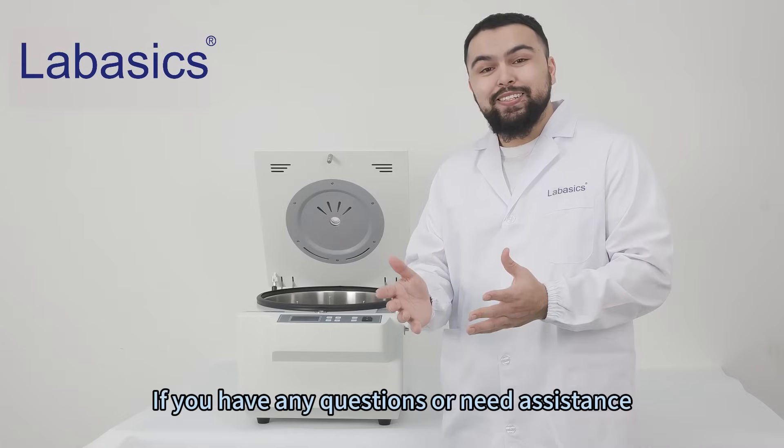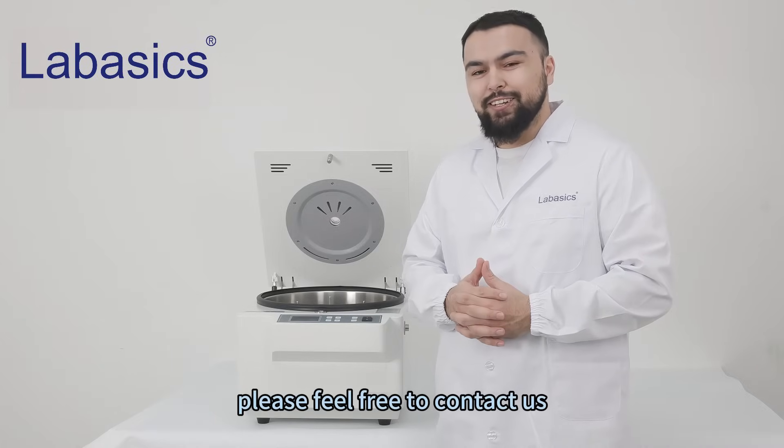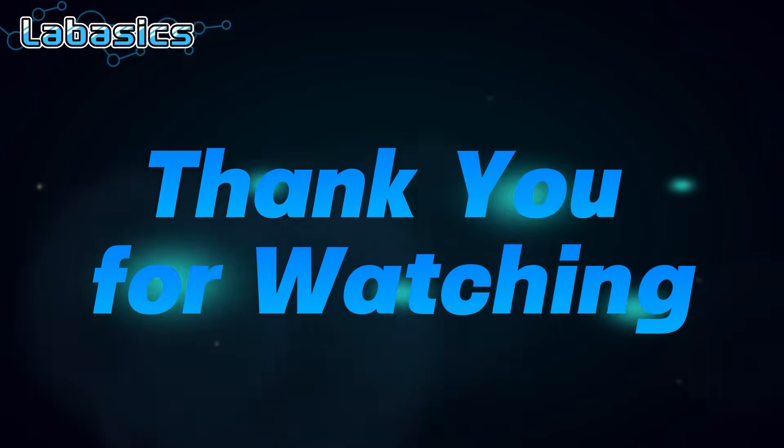If you have any further questions or need any assistance, please feel free to contact us.